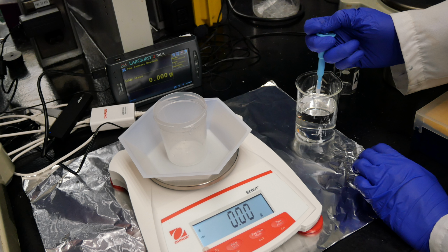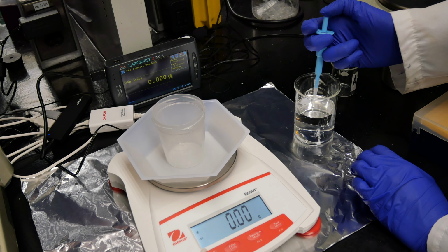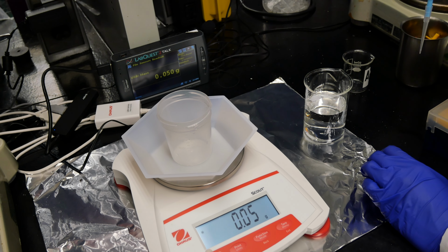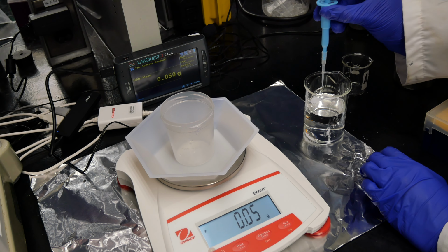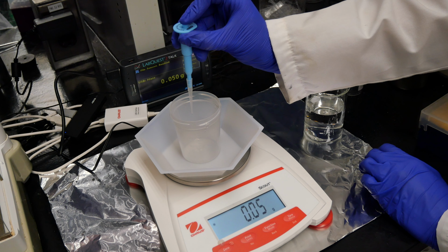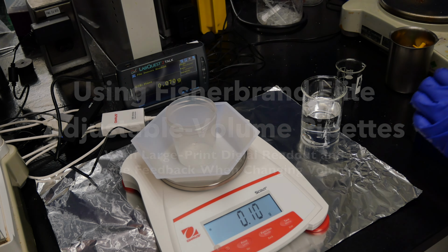Caroline is filling the 50 microliter fixed volume micropipette with water. She then puts the water into a beaker, which is on top of the scale. Mass 0.000 grams. Mass 0.050 grams. Wow, 0.05 grams is about 0.05 milliliters, which is 50 microliters.